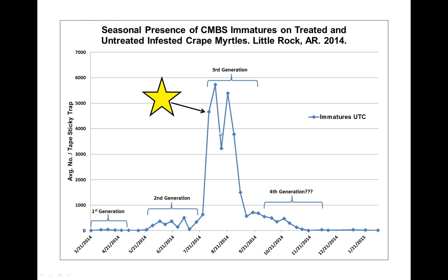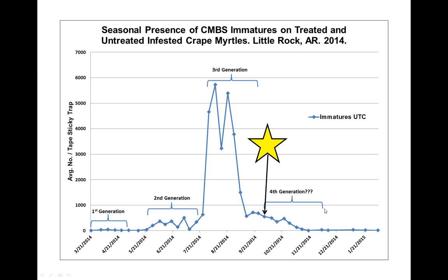Okay, this is July 31st, and that's the July 31st data point that you see where the population really took off. Okay, we move over. Now, this is just an example from October the 1st. You see there's a lot less on these tapes, and the data from that particular date is indicated here on the line. All right.